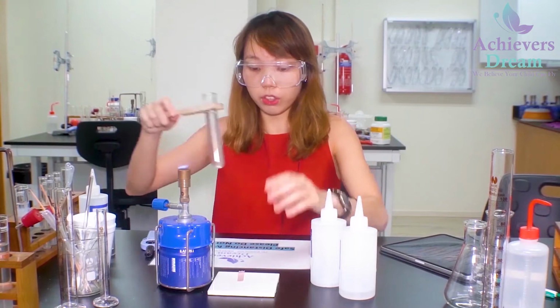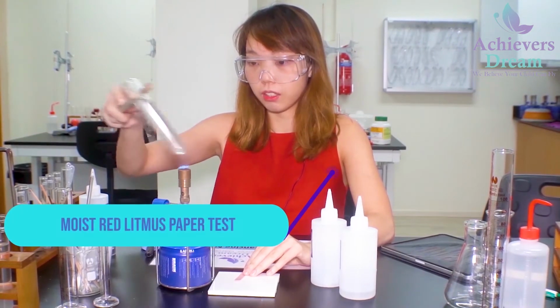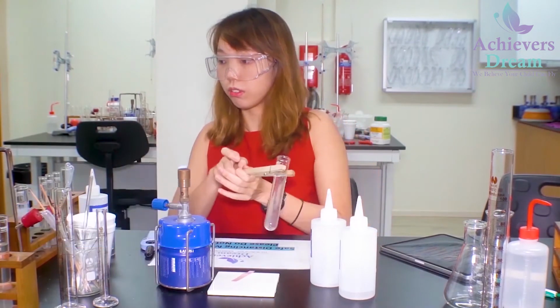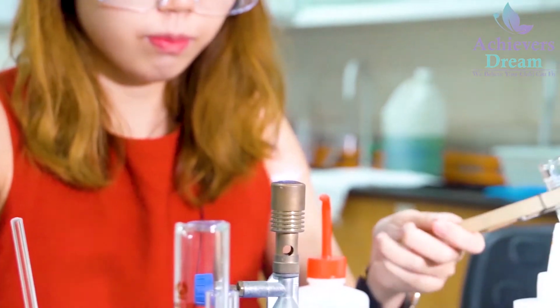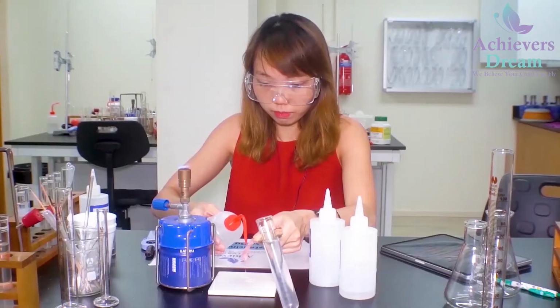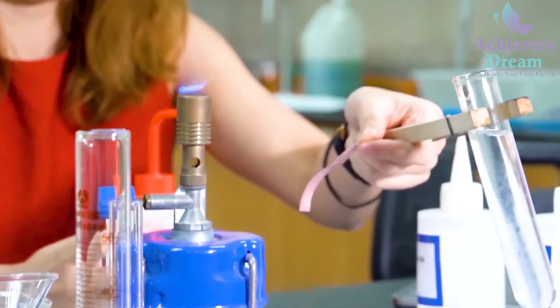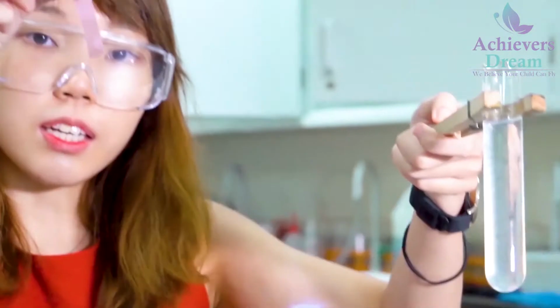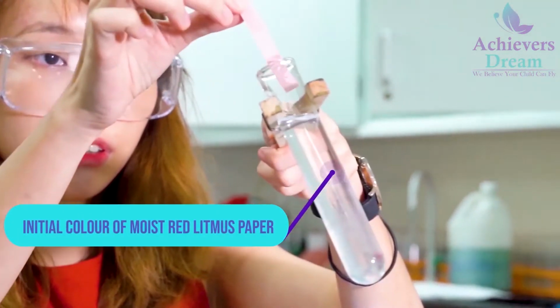Okay, so I'll be conducting the moist red litmus paper test. Okay, so this is the initial color of your moist red litmus paper.